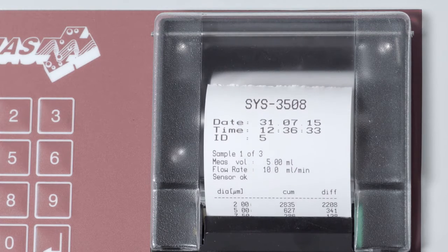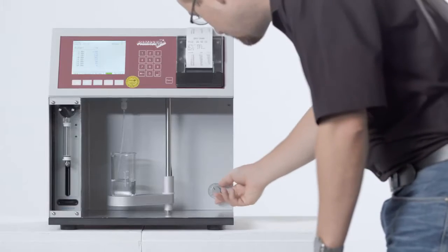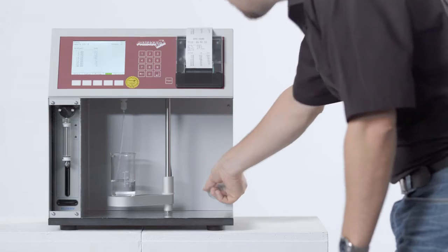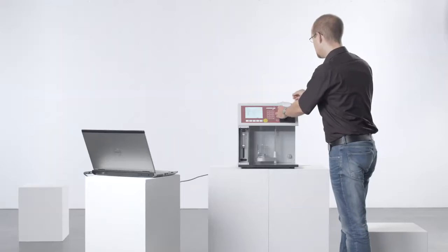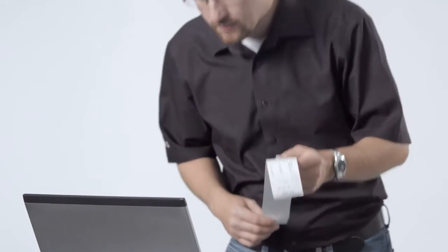All data can be printed utilizing the integrated thermoprinter. The instrument is equipped with 16 freely selectable size channels for the particle count report.